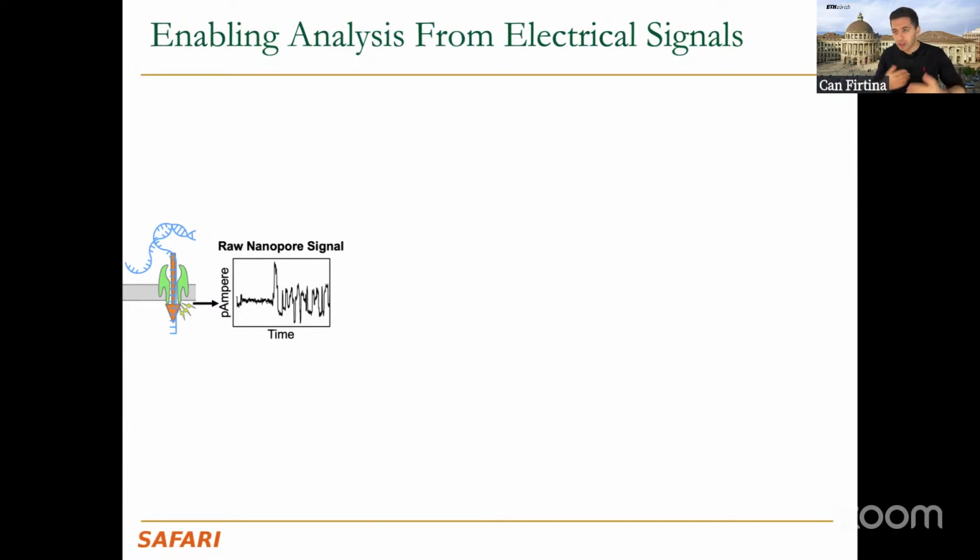And of course, the speed at which DNA moves through this pore also varies, which we refer to as translocation speed. But essentially, assume that we have an older version of nanopore. As we sequence the 6 nucleotide DNA portion, we will generate an electrical signal that is representative of these 6 nucleotides.